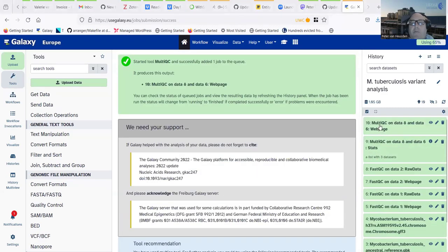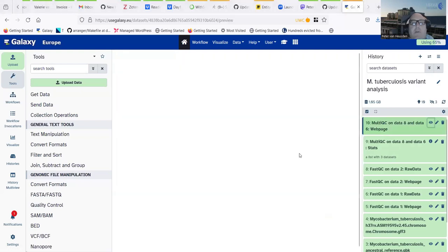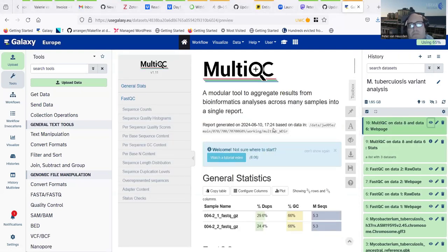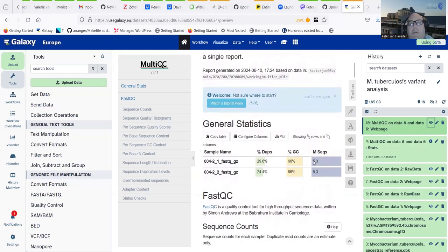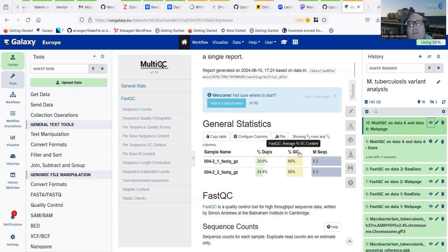With multiple datasets processed by quality control tools like FastQC, it's useful to combine outputs into consolidated reports. For that we go back to the tutorial and run MultiQC. I click on it, opening the MultiQC form. The first thing to notice is that MultiQC can work on lots of different QC tool outputs, so I must select the correct tool here, which is FastQC.